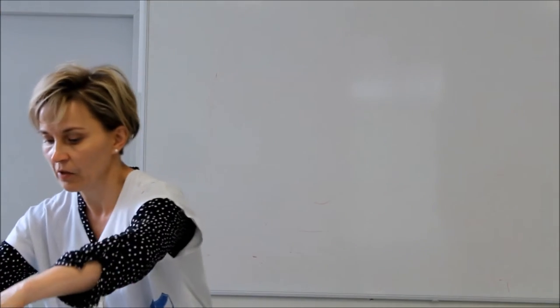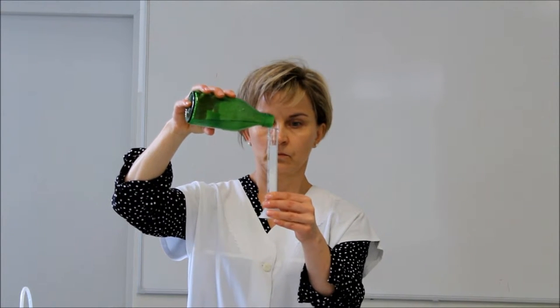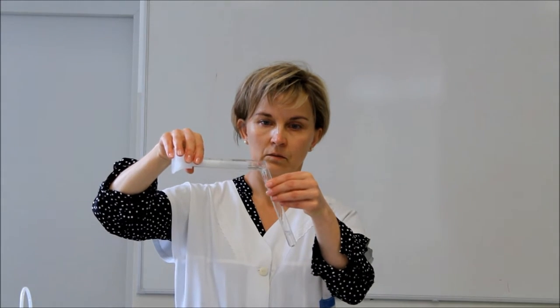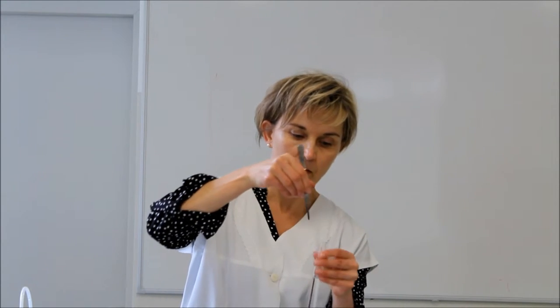A sósavat tartalmazó kémcsőbe öntjük a pepszin oldathoz. Majd pedig ezt nátrium-hidroxid oldattal is megismételjük. Ezután a kémcsőkbe főtt tojásfehérjét teszünk mindegyikbe azonos mennyiséget. Szikével vékony kis szeletet vágunk, és ezt három egyenlő részre hozva belehelyezzük a kémcsőkbe.